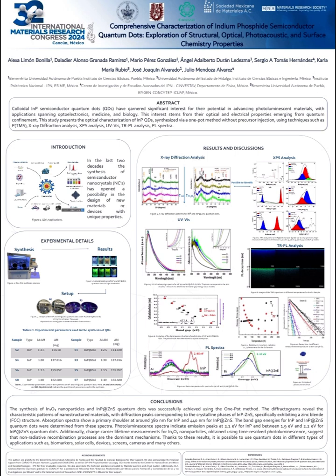Moving on to the XPS analysis, the details of this technique confirm the X-ray information, and we can also observe the formation of indium oxide but at a low level. This is what I mentioned previously: as we go down in the samples, the myristic acid increases and therefore the indium oxide. And as we were talking about sample number 3, this is why it has a low level of indium oxide.